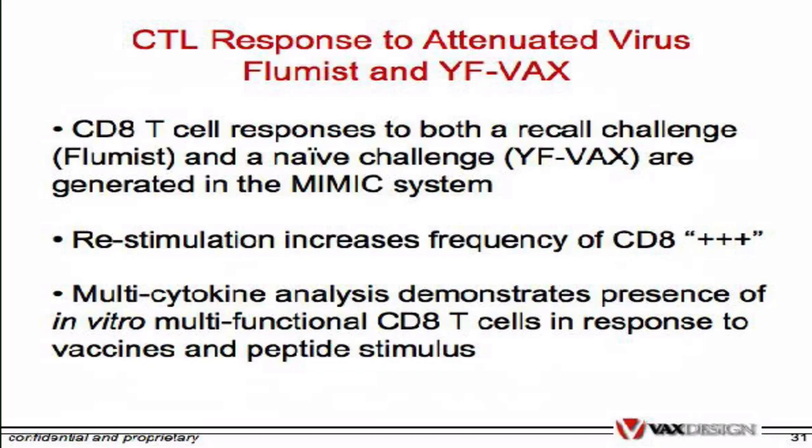CD8 T cell responses that we've seen to recall challenges, for example, flu mist, where we've challenged our cultures with flu mist, modified live virus, as well as naive challenges using the YF yellow fever vaccine. It's the 17D204 strain of modified live yellow fever virus. All have shown effective responses from antibodies or CD8 positive T cells in our system.